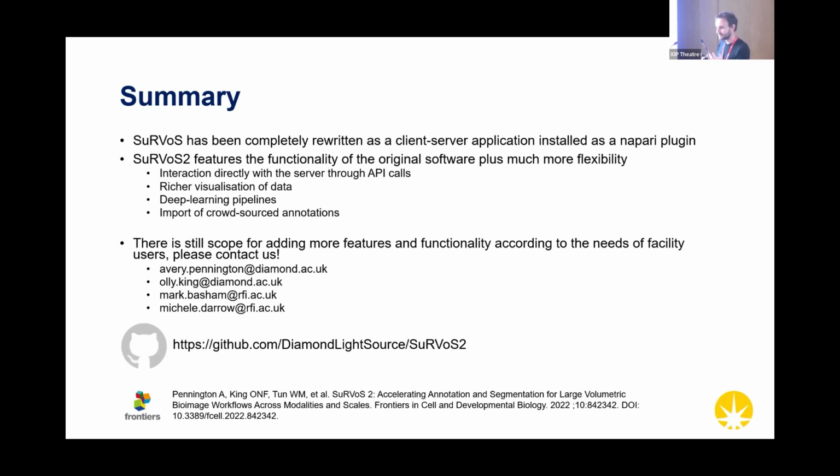My colleague was working on a project where people clicked on all these virus particles in a volume, and then we had to import all that data and use that as seeding points for other things. We can do various other things like clustering objects, and there are various other workflows, but there's still scope for adding more features, and we're open source. So if you want to add something yourself, then you can. If you want to tell us to add something, then we can talk about it.